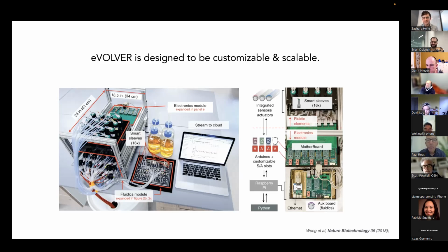Thanks. This is really cool stuff, Zach. I've been poring through your thesis in the background as well, which is also kind of wonderful. So, in coordination with Church Lab, in this How to Grow Almost Anything course that I'm working on, we're doing a project on bacteriophage. And from an automation perspective, plaque assays are a real pain in the butt.